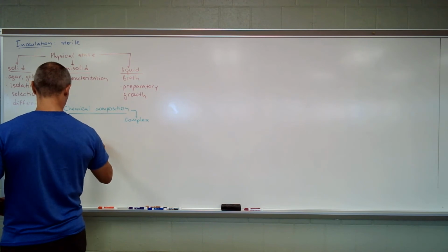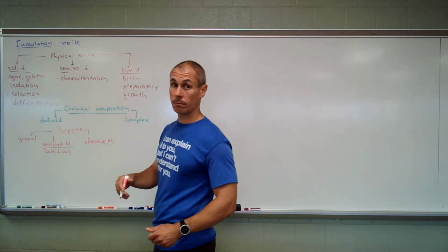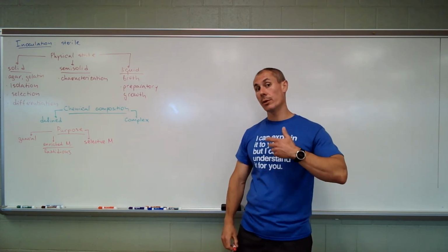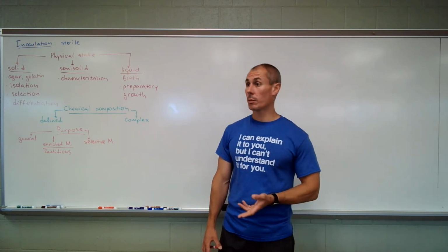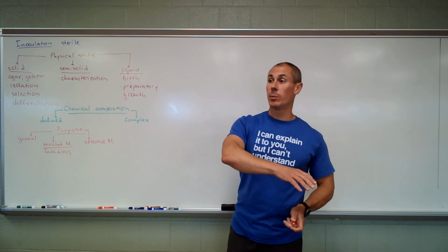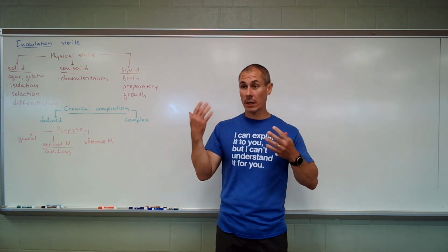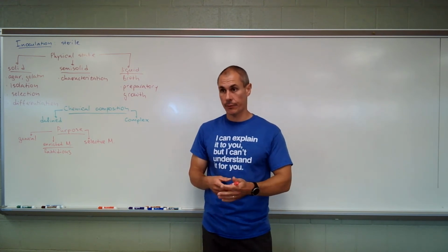So then you have selective medium. That's your Sabouraud agar. It inhibits the growth of bacteria, but supports the growth of fungi. Or MacConkey agar inhibits the growth of gram-positives, but supports the growth of gram-negatives. Do you get the gist of selective? So it selects for something.